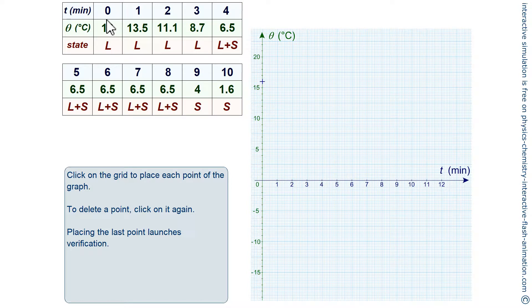We are going to mark the different dots of the curve. We can already see the curve. We can already see that there is a horizontal line.